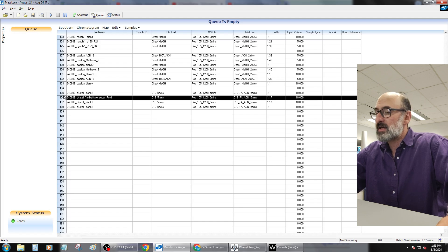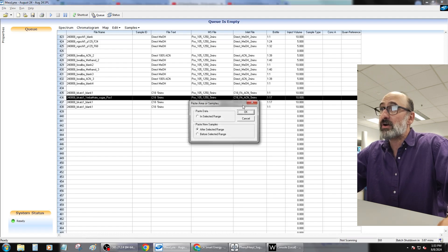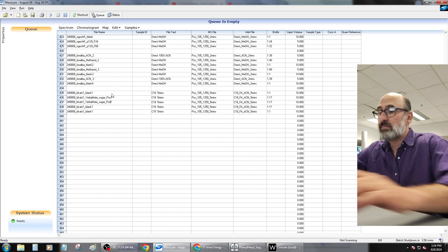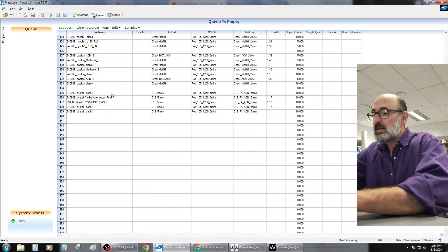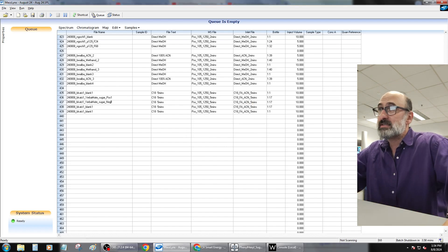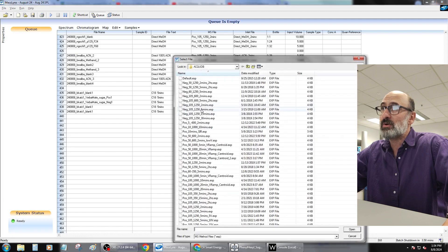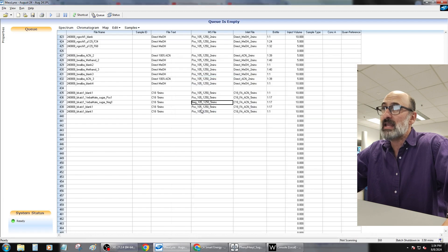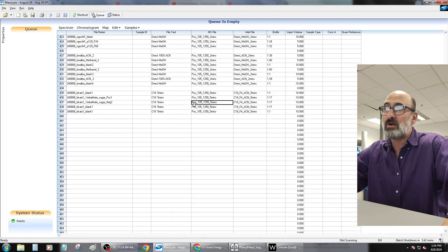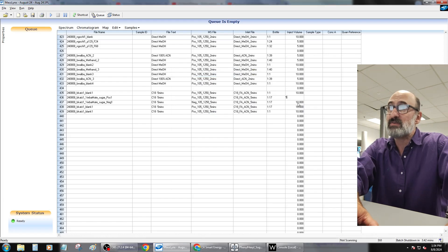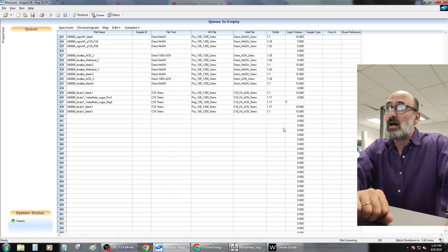Then I'm going to copy this, paste it again after, and I'm going to do my negative mode method. The negative mode method is the same LC method, but instead of a five minute positive mode method, we're doing a five minute negative mode method across the same mass range. Then we're going to make both of these five microliters.